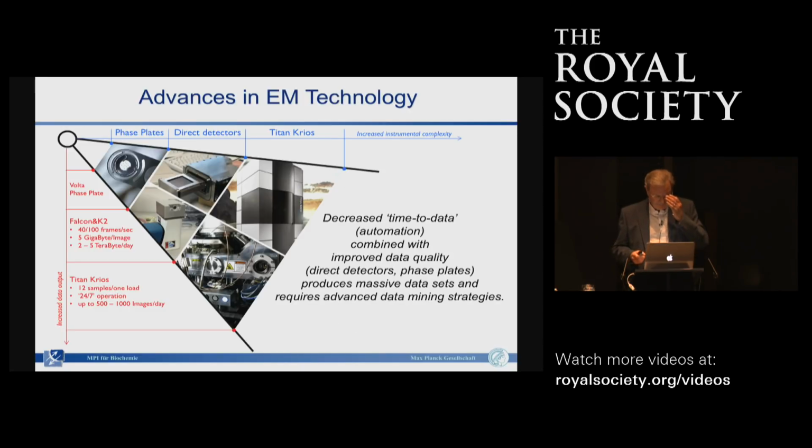accommodate in the structure. I think you have heard, and Wenke mentioned it, in recent years we have seen enormous advances in EM technology. I think one should not forget that an important aspect is the robotics that is in today's electron microscopes that makes automation quite a bit easier. It's just a matter of software nowadays. So very large data sets, I mean, microscopes can be operated more or less autonomously. We can obtain very large data sets of fairly consistent quality.